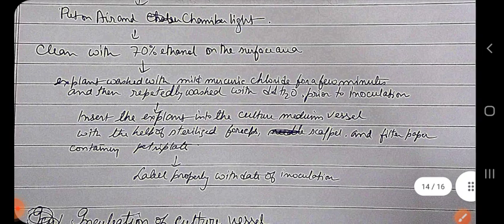Then after that, the petri plate which contains the filter paper has to be used now. We have to place that explant onto the filter paper within the petri plate so that the water can be absorbed, and we have to cut out the exposed portions of the explant which were directly exposed to the mercuric chloride solution. We have to cut down that part a little bit.